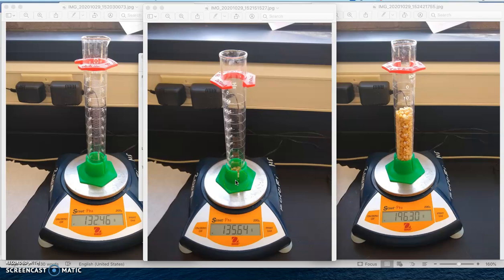So the lab that I'm covering here, I have 3 pictures of data. This is estimating the size of a mole lab. Now, there are 3 pieces of data you needed to collect in lab. The first one, you had to collect the mass of an empty graduated cylinder. You got a mass down here. I'll let you write that down on the paper. I'll also pull that up in a second.